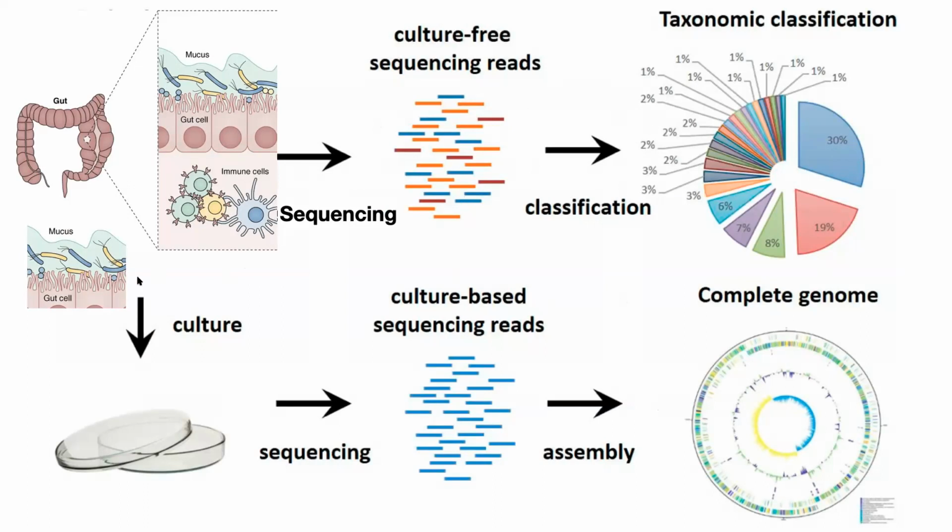One of the problems in next generation sequencing is that you just don't have enough DNA or RNA material. So if you do want to have enough material, you have to first culture that material, and then you can sequence based on that culture. That culture is very different typically from what you find inside the host cell. And it's very different because of the diversity. These are different organisms that interact with each other and live as communities. If you disrupt that community, you extract it from its normal environment, the composition is going to change.